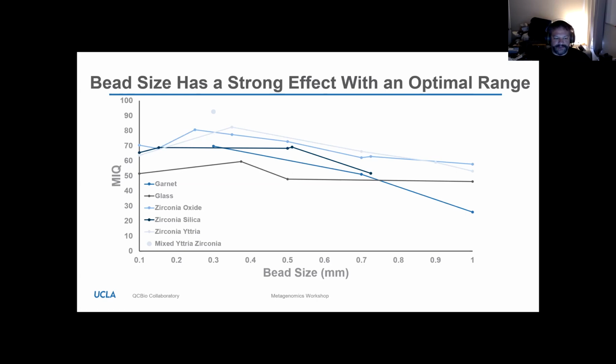And the equation 1/2 mv squared basically describes the energy that's being imparted. It's a basic rule of physics. It doesn't change. And it also means that if you have beads of different densities, the denser bead is going to have a much bigger mass.